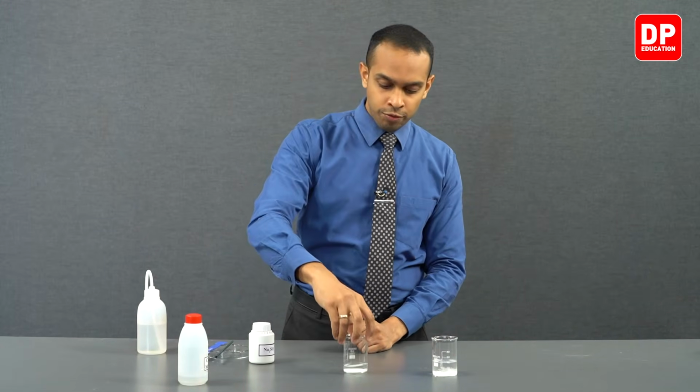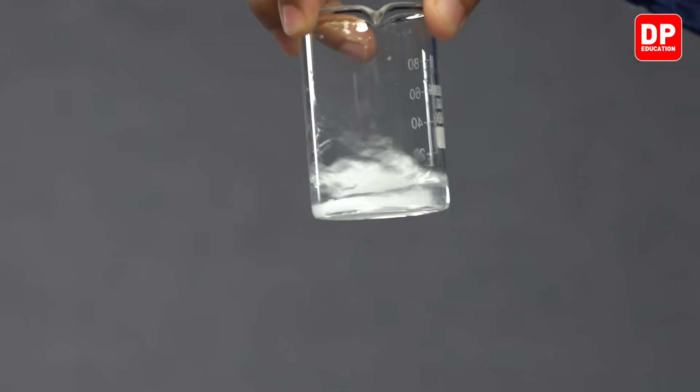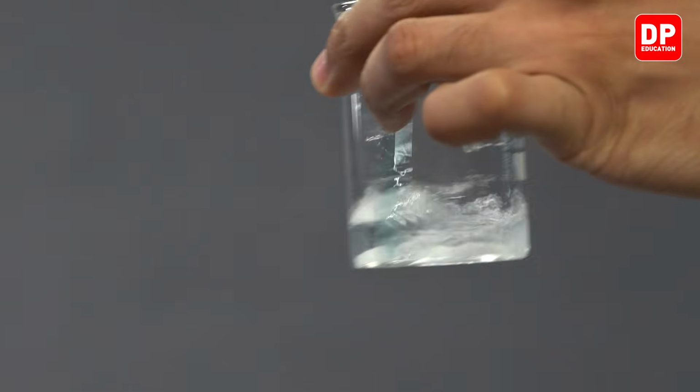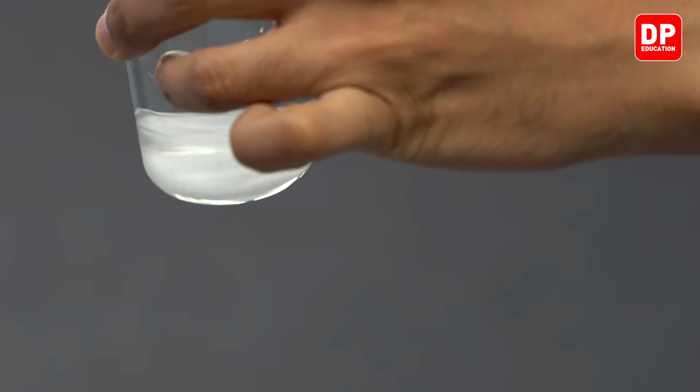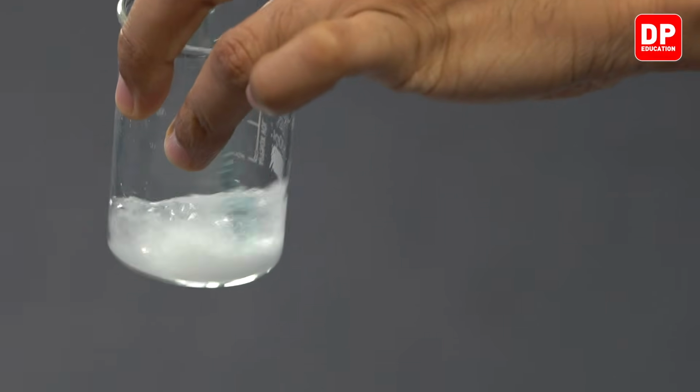But if you observe over here, the sodium sulfate is present as a powder. If you mix it really well, you can see sodium sulfate is not forming clumps.